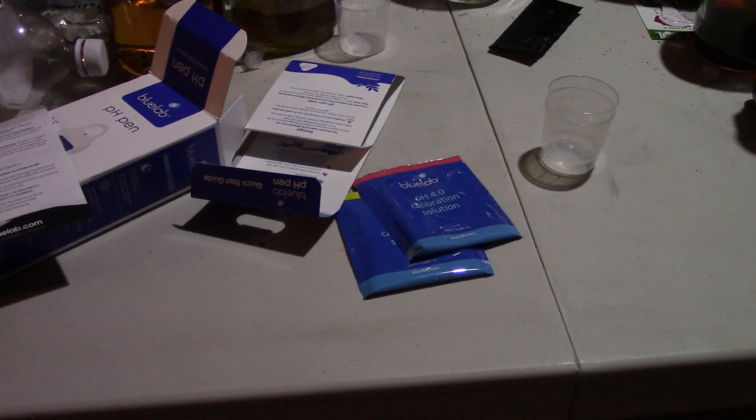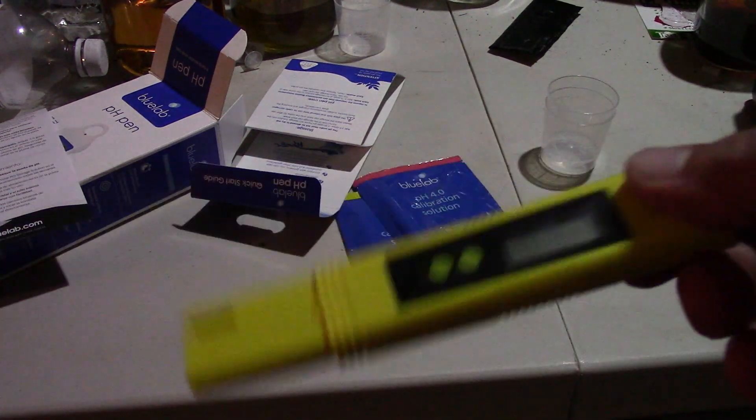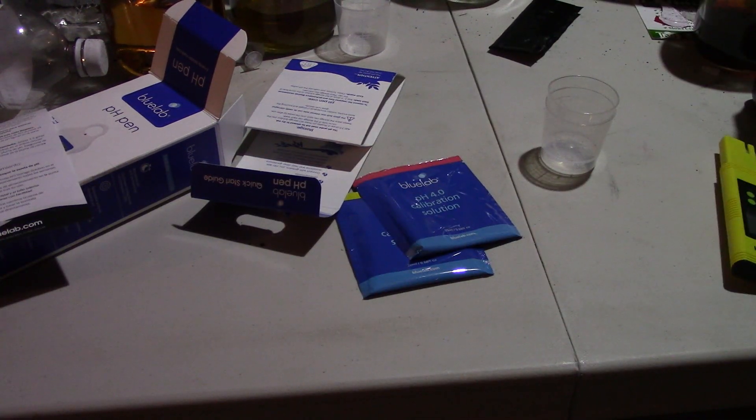So there's lots of care for this pen. I ordered a different pen company as well - it came with a box and a thing, and it was about the same price point, not the $30 cheap one. Once I get this one and once I get the other one, I'll try to see what they look like and see how they work together on the same liquid - see what kind of different readings I get - and decide which one is the best. I don't know which one is going to work well, but I guess we'll find out shortly.